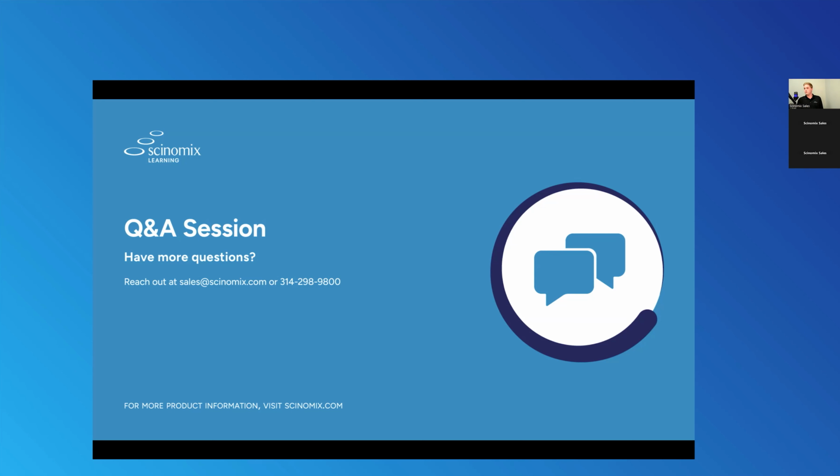Yep. And then we'll take one more from Sebastian. Are there multiple tip types, or is it one size fits all volumes for 5 microliters to 1 mil? There are numerous different tip types. This is where the user is training the system that these are different tip types. So you can use whatever tip type works best for you. As long as it's an automation tip, we certainly can use it.